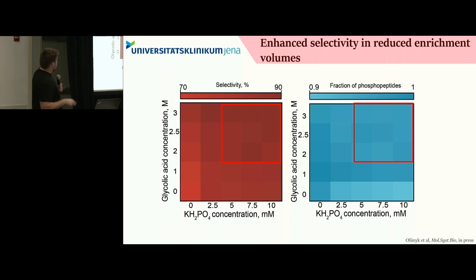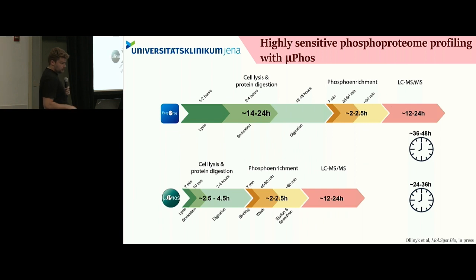And this is not the only thing that we optimized. We also optimized the protein digestion a lot, significantly reducing the digestion from overnight to just several hours. And in comparison with the previous generation EasyPhos, we are now able to perform all steps of the experiment, from cell culture to clean phosphopeptides, in just around 8 hours of working time, plus of course extra mass spectrometry time.